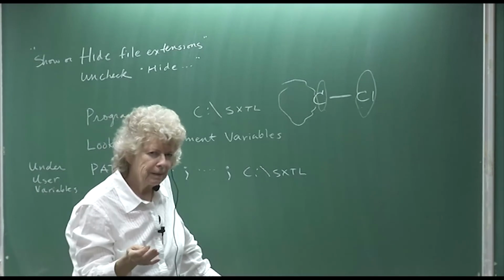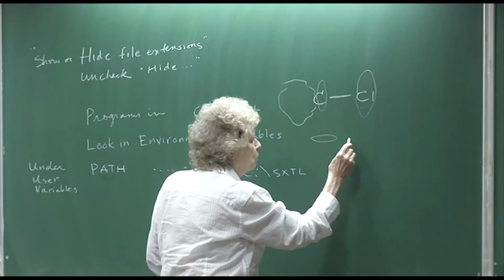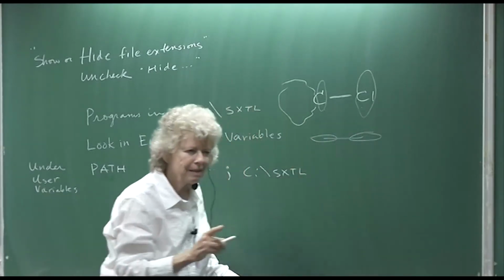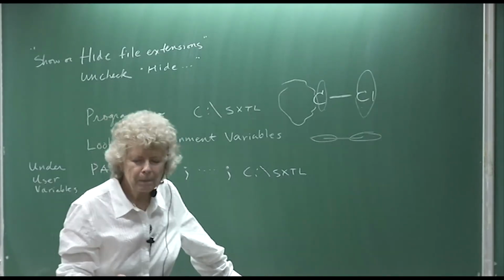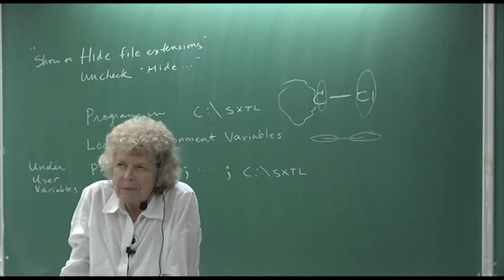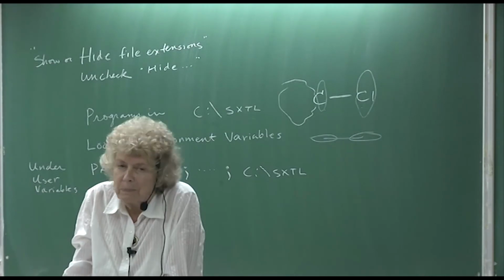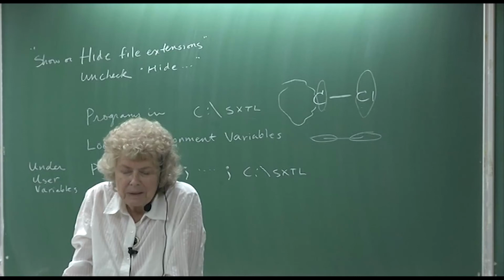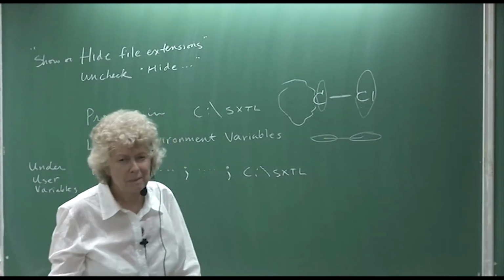If the Hirschfeld thing is bad, then the thermal ellipsoids are pointing more towards each other. Now, in my experience, that complaint is only because in a lot of cases you have a metal atom, and the metal atom has more electron density that's due to the bonding electrons, like d electrons, and those are going to make the thermal ellipsoid a little funny, especially if it's a heavy metal atom.